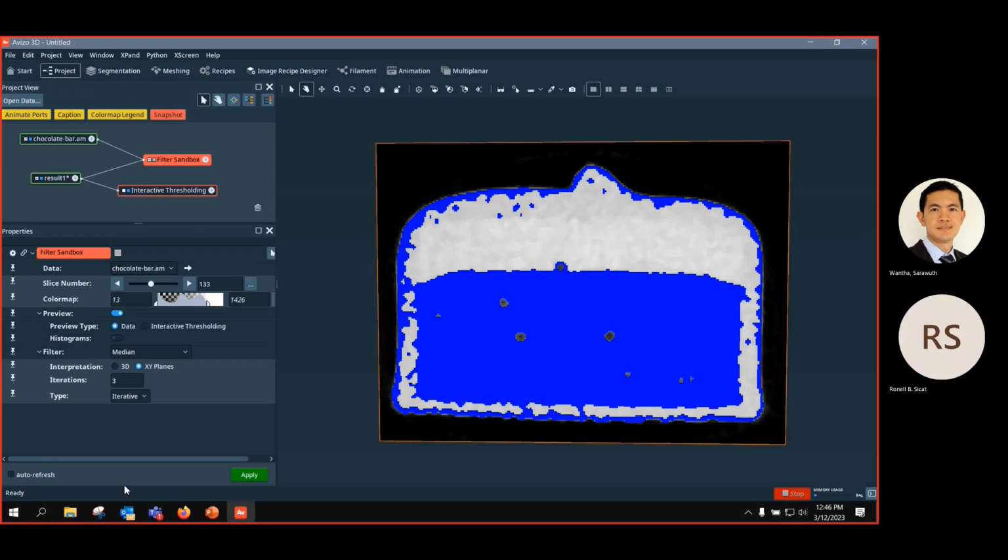Any questions? We started segmentation. Could you explain a little bit more about the preprocessing of the images? Like histogram normalization. Yeah, sure, show us the results.